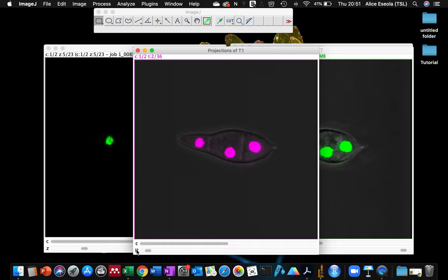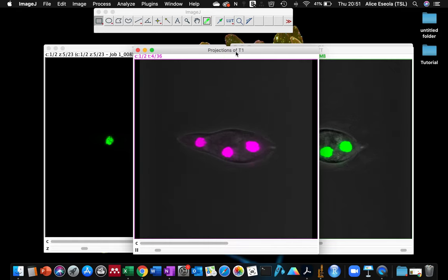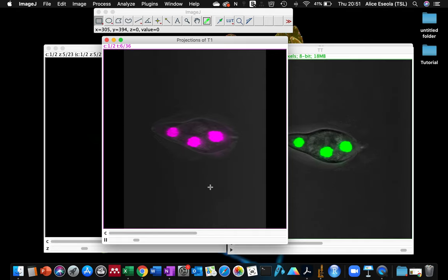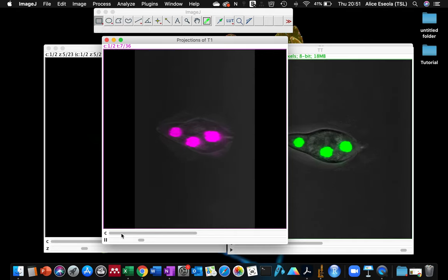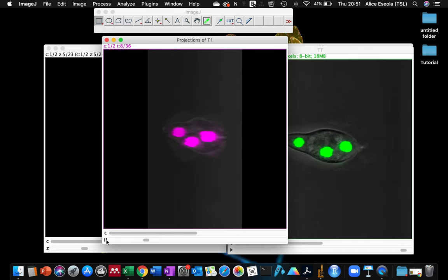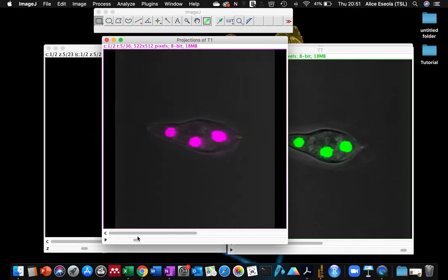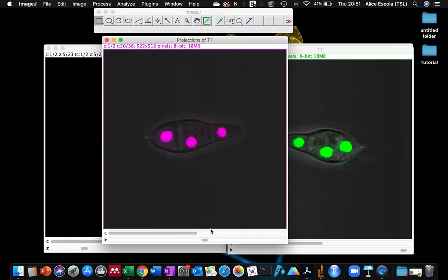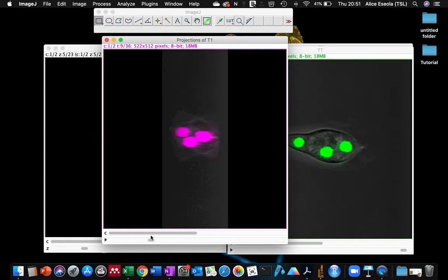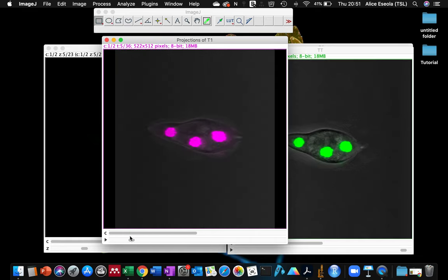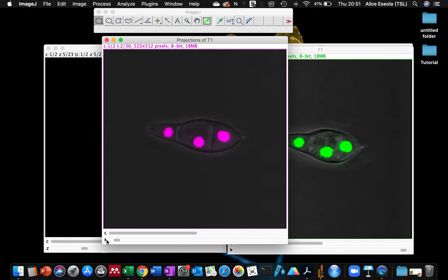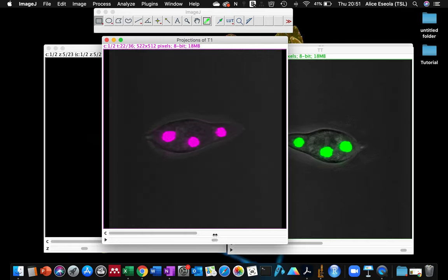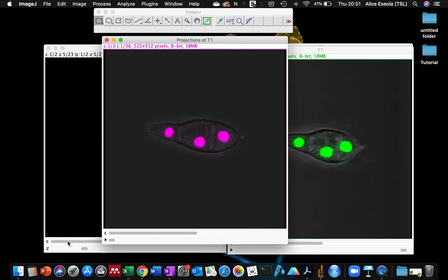As you can see now we have a fluorescence image in the brightfield image and it's really cool because you can see the position of your sample, of your fluorescence image, within the object. It's really cool.